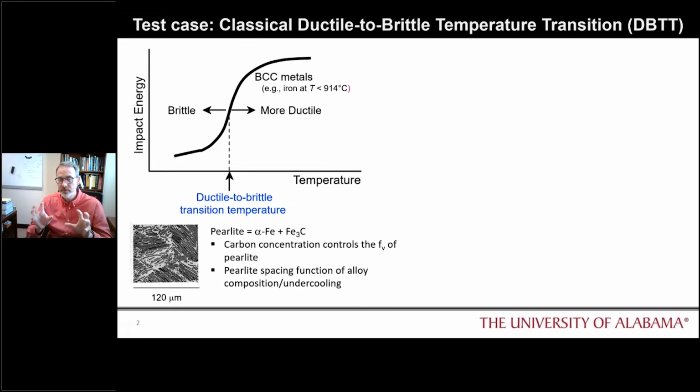Like many experiments, this was very preliminary. When we got started, we really wanted to take advantage of having the capability of cryogenic testing and see what we can learn from it. Obviously, with many experiments, after you finish, you look back and see differences in what you would do before. So I would like to couch this discussion as a preliminary look at how the PI-89 can be used in studying micromechanical behavior, at least for the DBTT examples.